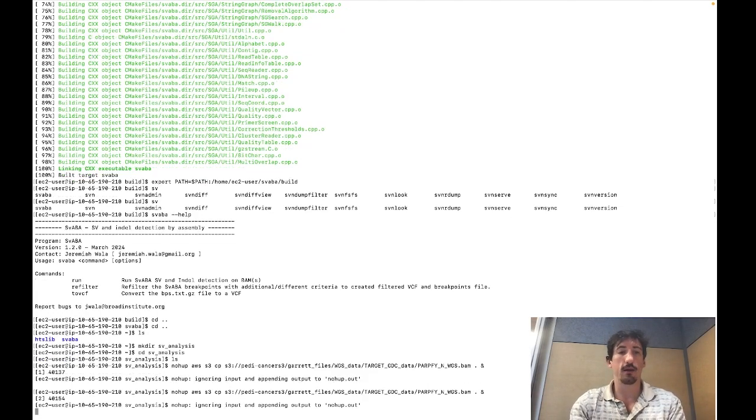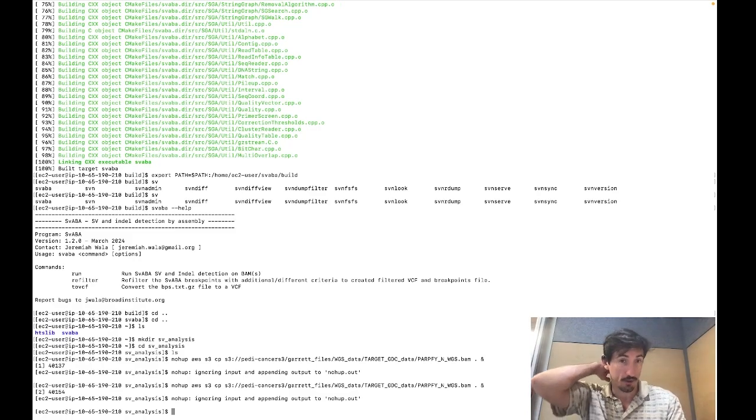So we're expecting actually to be few structural variants outside of SMARCB1 variation. So rhabdoid is defined by biallelic SMARCB1 dysfunction, and so we're hoping to identify some sort of structural variant at SMARCB1 in both alleles in the tumor sample here.